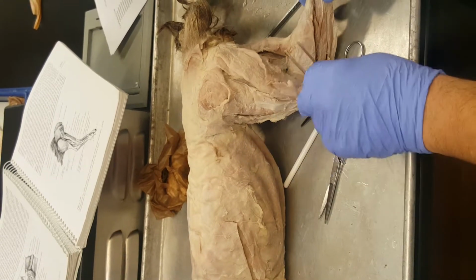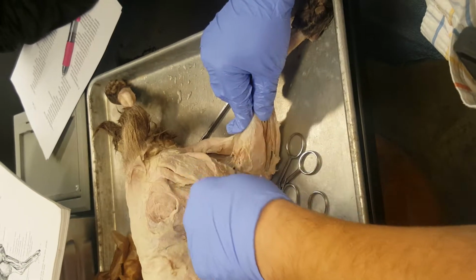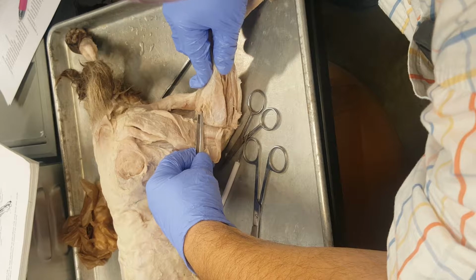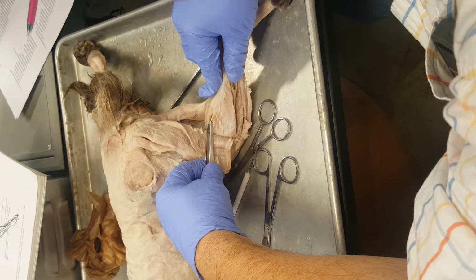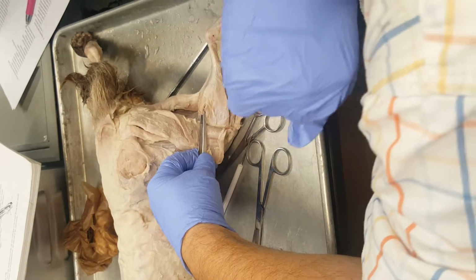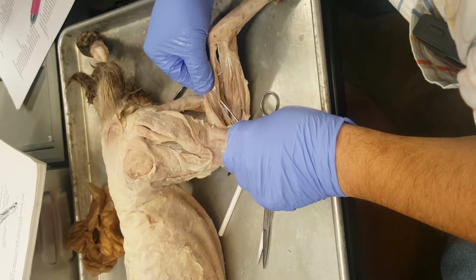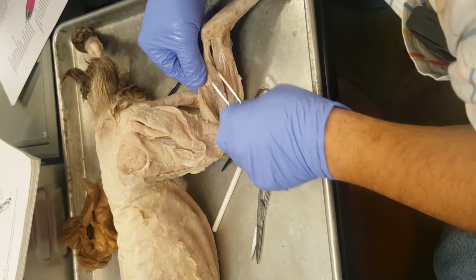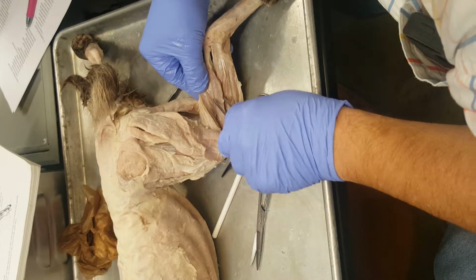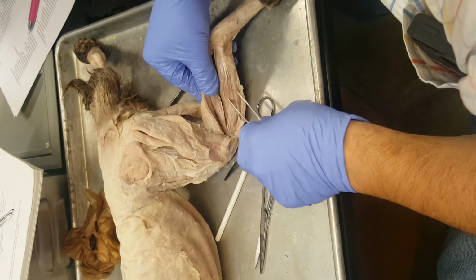Then here's your gastrocnemius, which means big bellied muscle. It's got a lateral head and a medial head, and in between the two heads is the plantaris, also known as the flexor digitorum longus. Or superficialis, I'm sorry. Flexor digitorum superficialis. There's the soleus, which means little flat fish, because I guess they thought it looked like a fish. Tail, body, head buried up there. But watch it. Right? I know I'm weird.